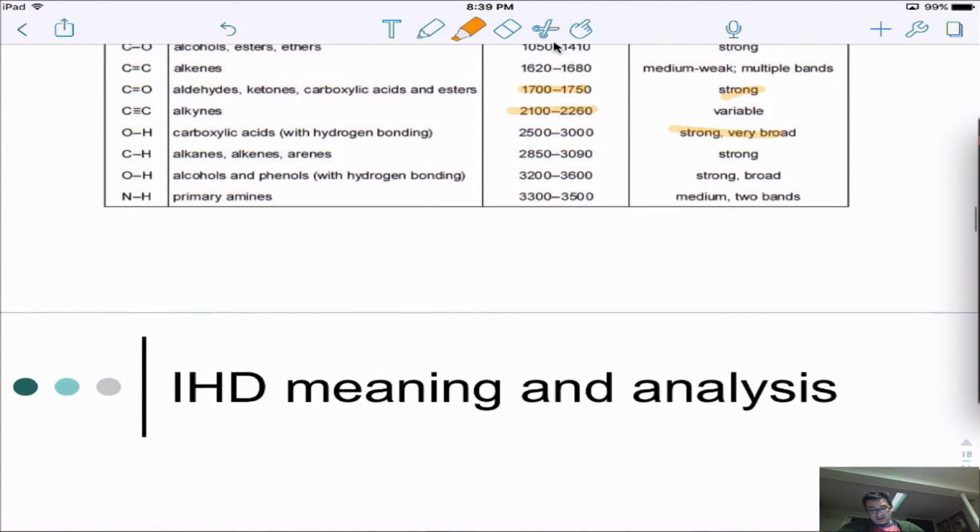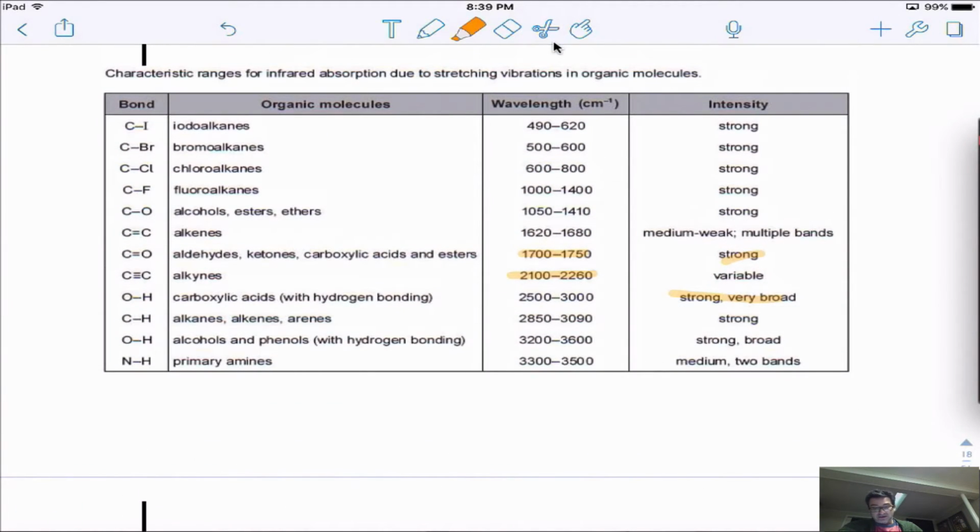So when I look at one of these IR spectra, and we'll do that tomorrow, we'll spend time in class analyzing it, we'll really look at where the peaks are. Now, you can't tell 100% what the molecule is by using this technique. Let me just be clear about that. I know I've said that, and I'll say it to you again: you can't identify it fully. But you can get an idea of what the functional groups are, and you can narrow down your scope of searching for the molecule.